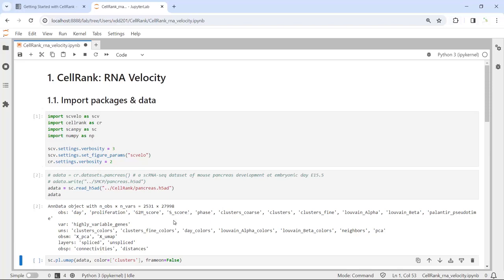You can use this code to download the pancreas dataset. Because I downloaded it already, I saved it as pancreas H5AD data, and we can use the sc.read function to load it. This data has 2,531 cells and nearly 28,000 genes. It already has the pancreas pseudo-time analysis performed. In this video, we just need to perform the scVelo analysis to get the RNA velocity trajectories for the pancreas development.